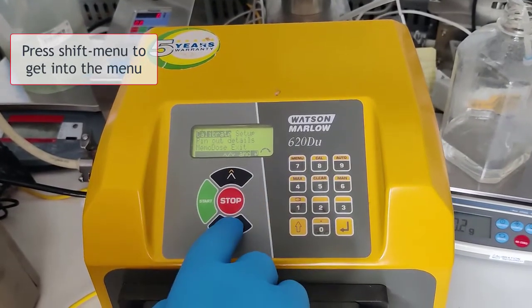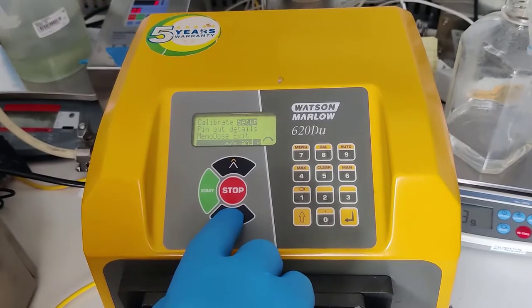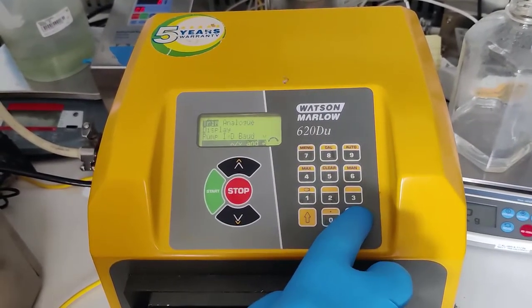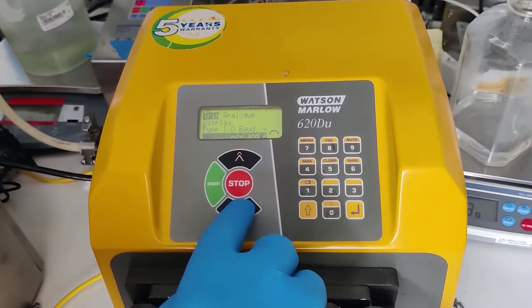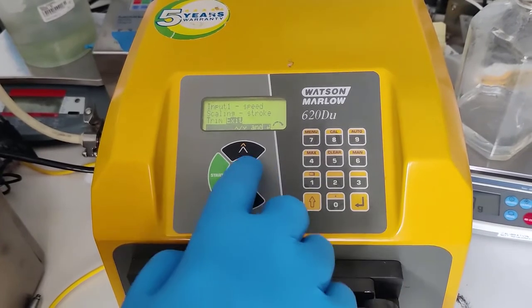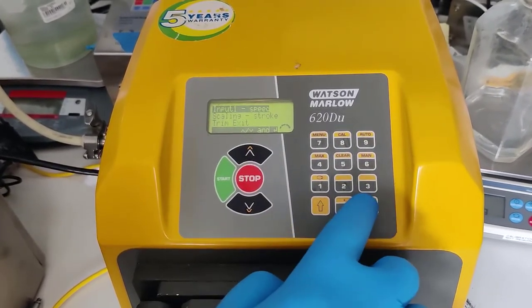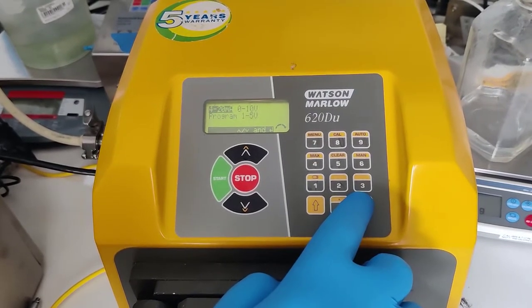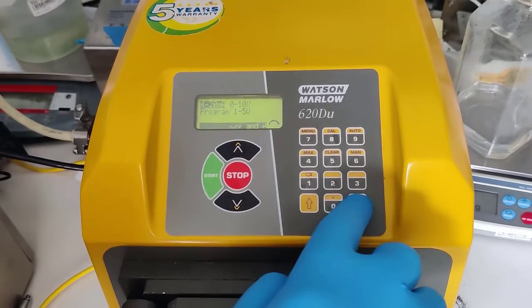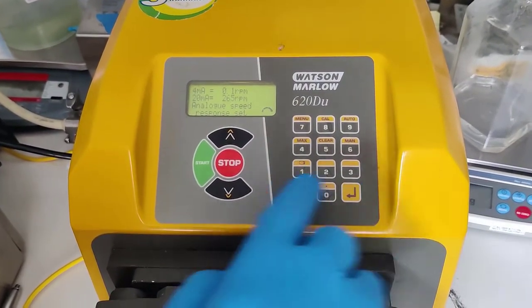Go into the menu, then go into setup, pressing the arrow to go between the choices. Press enter and go down through the different choices. Analog must be on — remote speed control and 4 to 20 milliamp. Make sure that choice is set to 4 to 20 milliamp and it says analog speed response set.